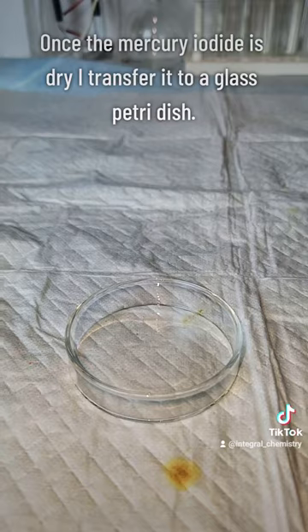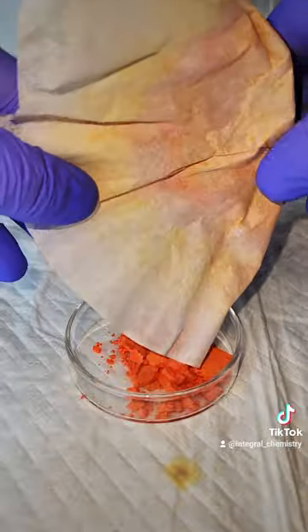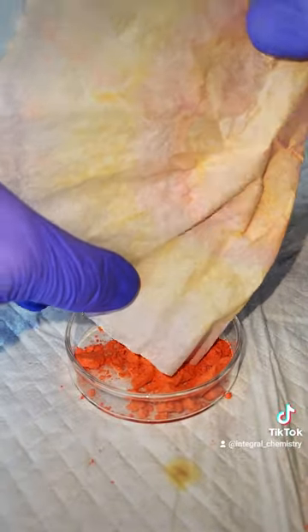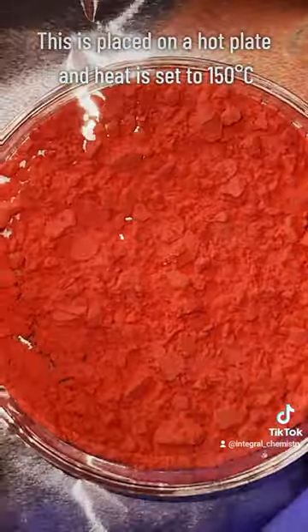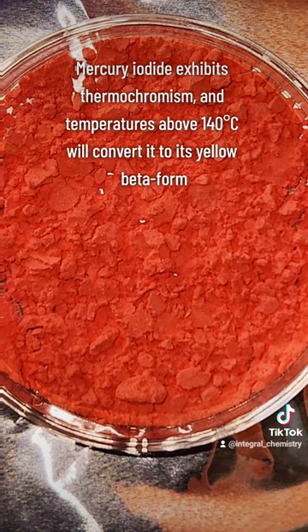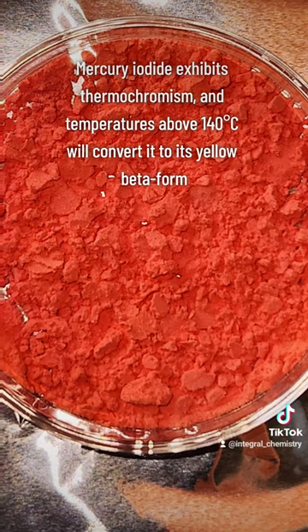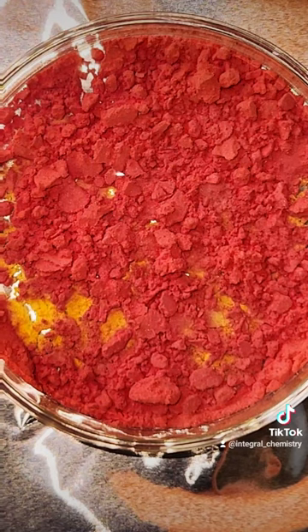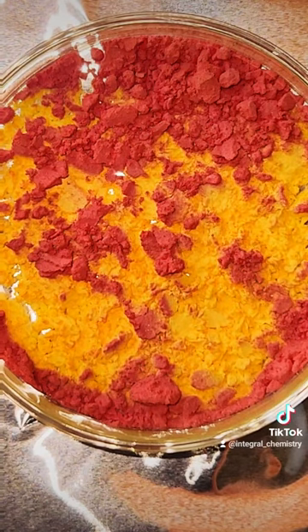The dried mercury iodide is transferred to a glass petri dish and put on a hot plate cranked up to 150°C. Mercury 2 iodide is one of the few inorganic compounds that exhibits thermochromism, or changing color based on temperature. It can exist in a bright red alpha form or a bright yellow beta form at temperatures above 140°C. By heating it above this temperature it converts to its beta form, and by cooling it below this temperature it converts back to its alpha form.